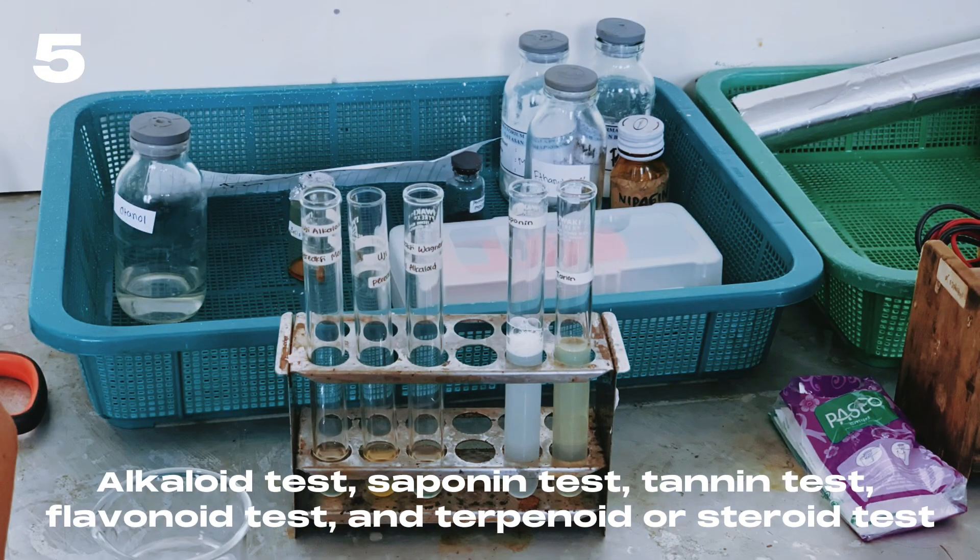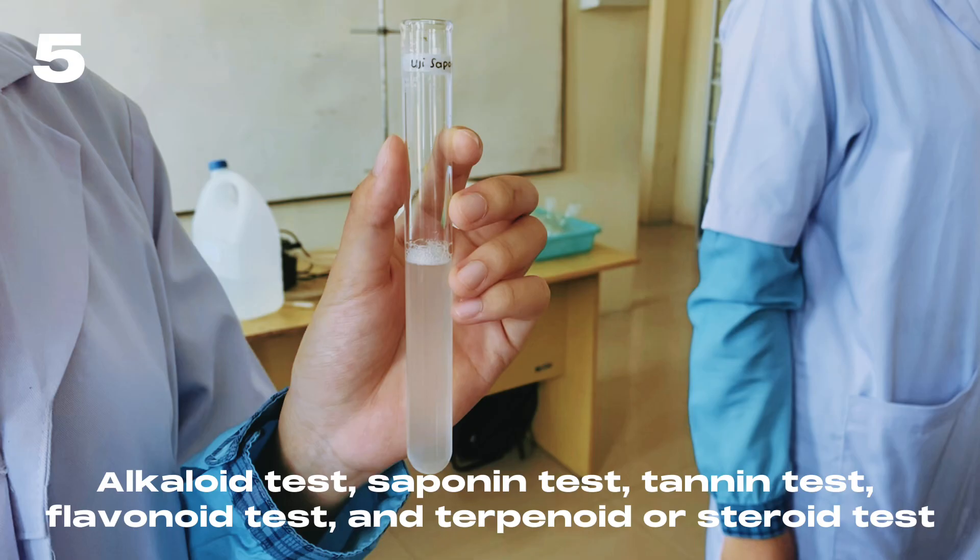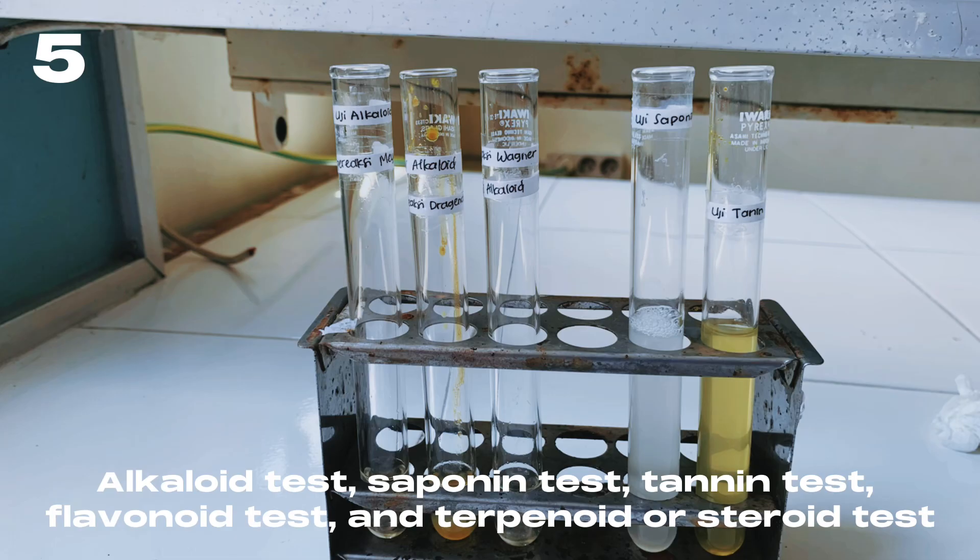The phytochemical tests performed include: alkaloid test, saponin test, tannin test, flavonoid test, and terpenoid or steroid test.